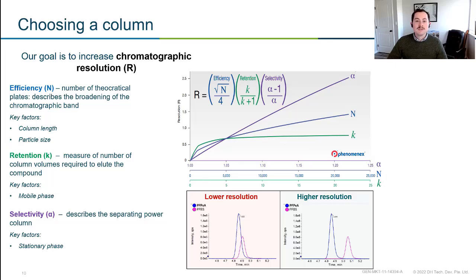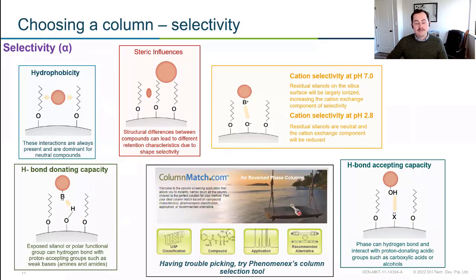But probably one of the most important factors, and if you look at that graph, you can kind of see it's one of the most important variables for chromatographic resolution would be your selectivity. And this is really your stationary phase and how your compounds of interest and your compounds that you're not interested in interact with your column. So during the method development section, we'll kind of dive in deeper into specific column stationary phases. But for now, I just kind of want to introduce some of the properties they're using to interact with that stationary phase.